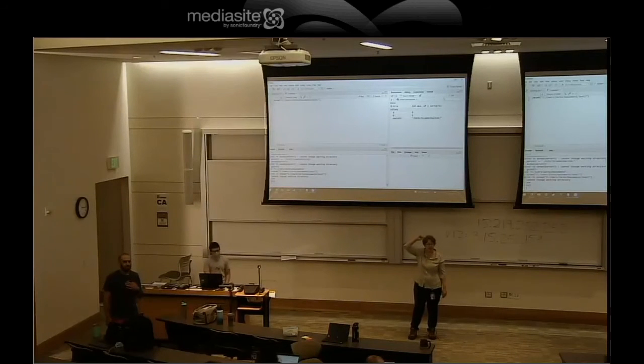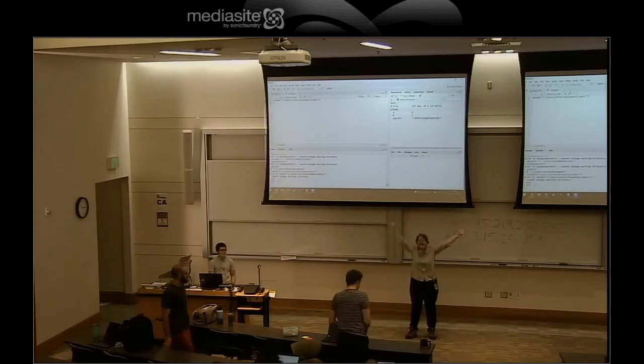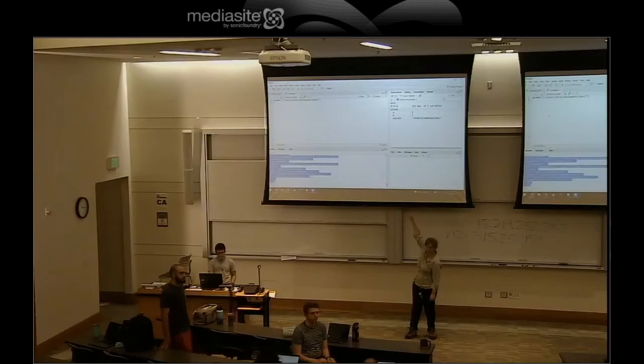If I am actually manipulating anything, I do it up in the top, and then I run that one line. Because if you set variables in the bottom, but they're not in your script, they go away. You cannot recapitulate them. So unless it's head, tail, number of columns, it should be up in the top, and you should hit run.